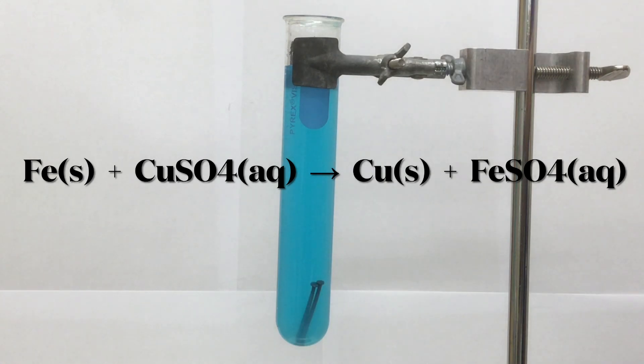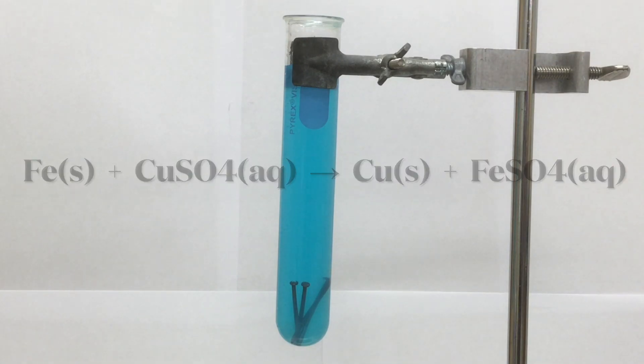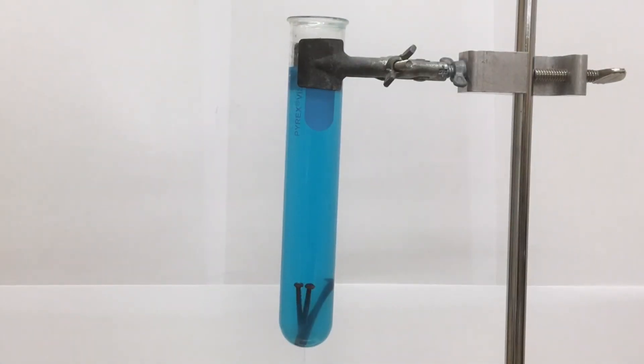Here's the overall reaction: iron solid plus copper 2 sulfate solution yields solid copper metal and iron 2 sulfate solution. This is a relatively slow reaction, so we're going to speed this up with time-lapse photography.